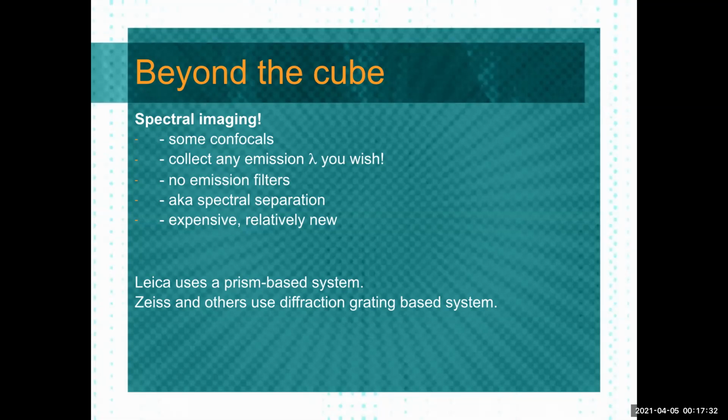Those spectra were created by putting the fluorophores into a tube and using a spec to measure the different colors that are coming off of something or that are present in something. That's what a spectrophotometer does. And the confocals are basically a really expensive spectrophotometer. It costs a lot more than a normal spec, but that's because they're doing a lot of other things; it's like a side job that they can do these days.